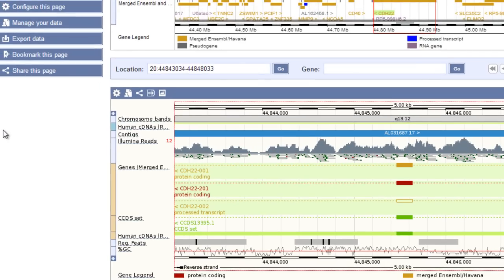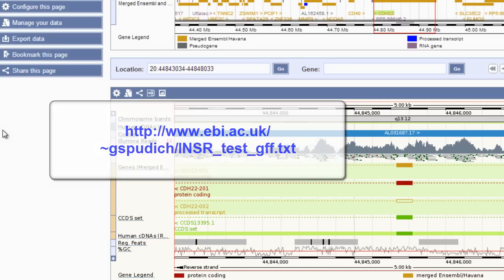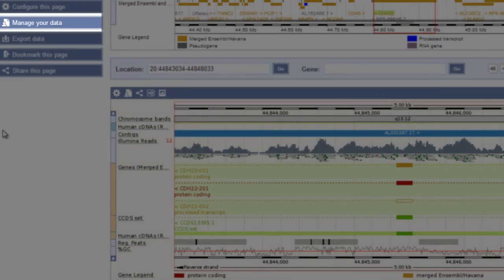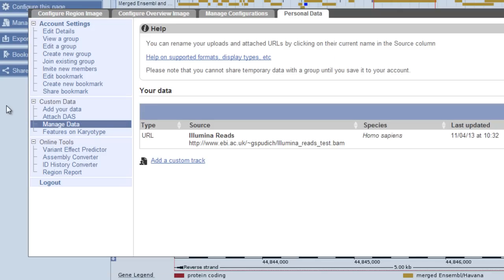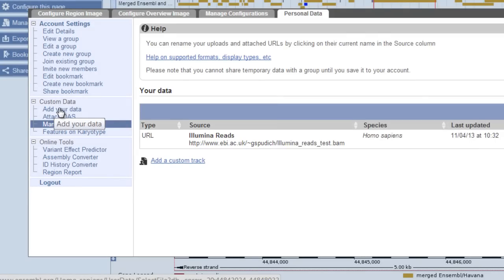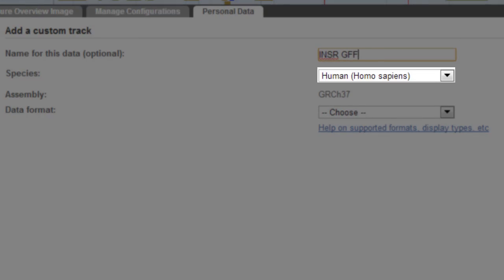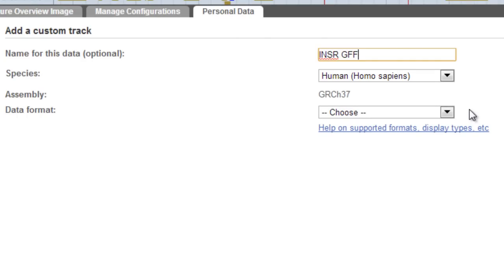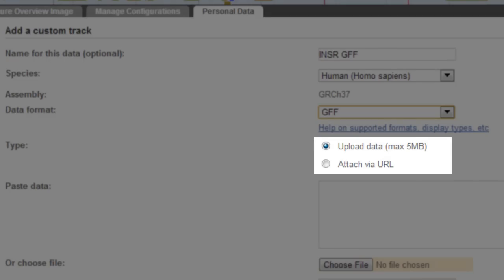So can I use a smaller file and upload to Ensembl? I'll do this with a GFF file of splice variants. Add Your Data has become Manage Your Data since I already have data in Ensembl. I'll click Manage Your Data in the left-hand menu, then navigate to Add Your Data to add something else. Let's name this one INSR GFF. Again, I'm in human so I'll leave that as is, and I'll choose the file type as GFF. Now I get the choice to either upload to Ensembl or attach with a URL, as I did before.